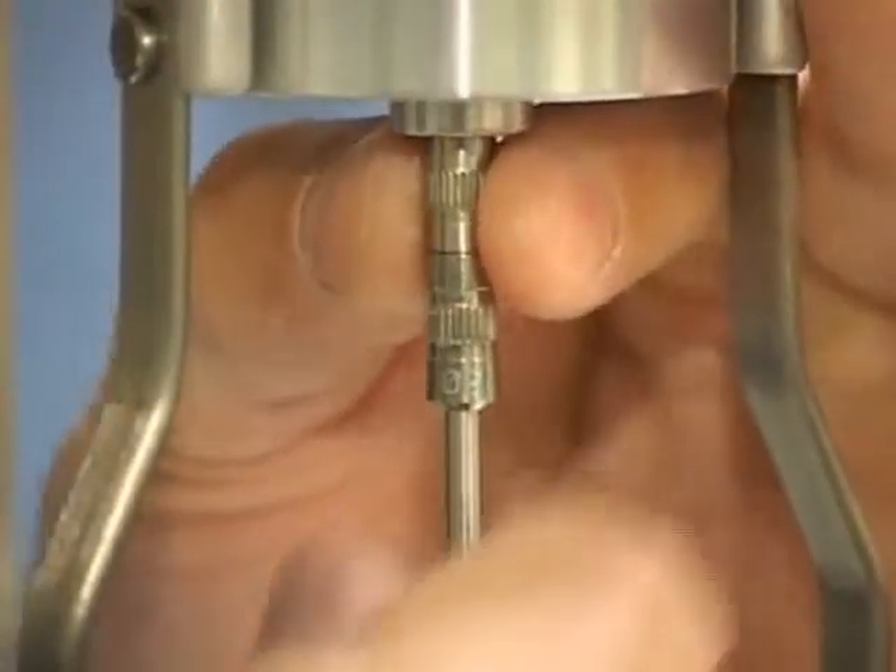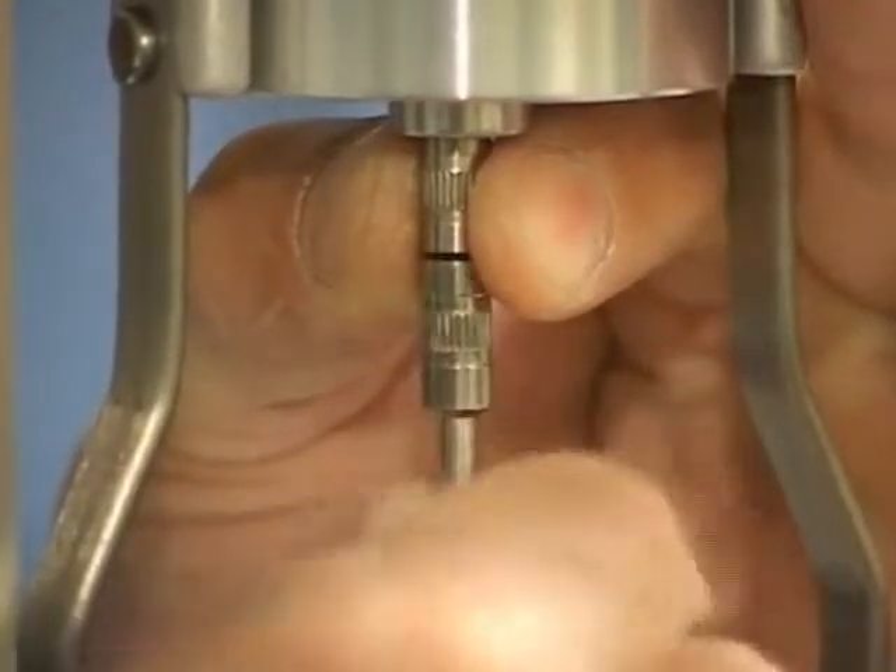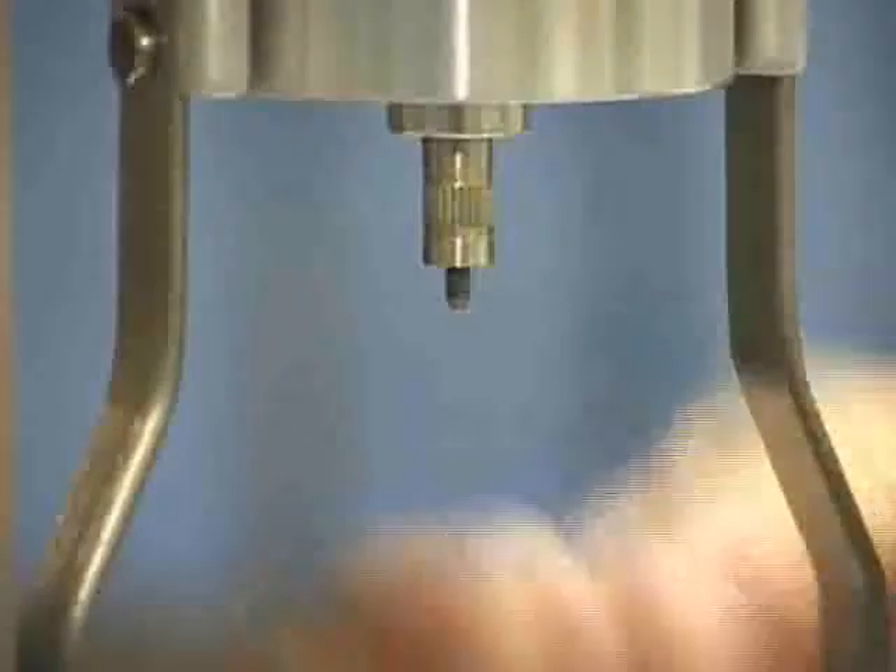To remove your spindle, gently lift up on the coupling nut and unscrew the spindle. Keep in mind that it has a left-handed thread.